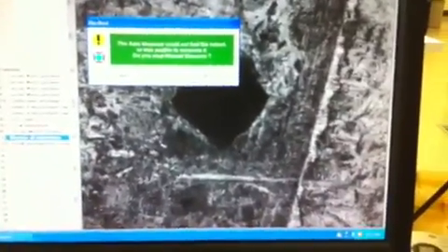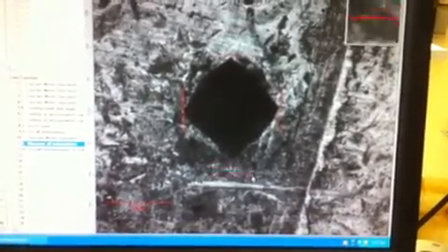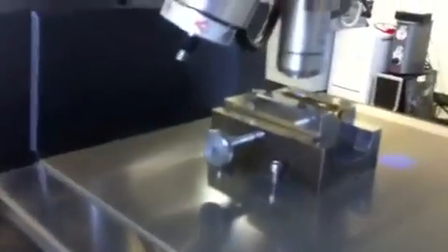Now for this particular bullet shell, I apologize, the sample has been tested quite a lot. It's got a lot of scratches on it, which can affect the algorithm. But it has been very repeatable up till this short video. Also, with the relatively soft material and the 2.5 kg load, the indents become a little bit rounded, which makes it difficult for the algorithms.